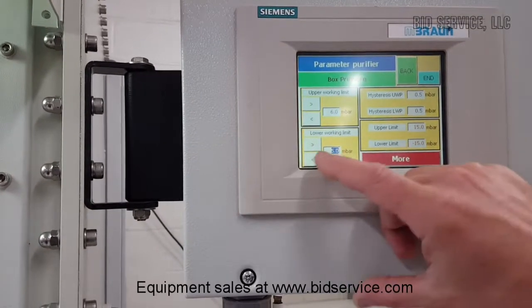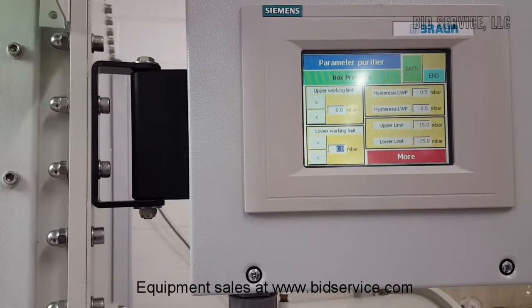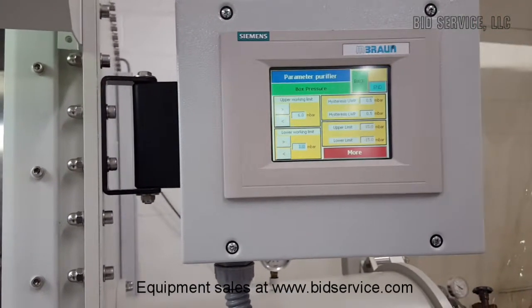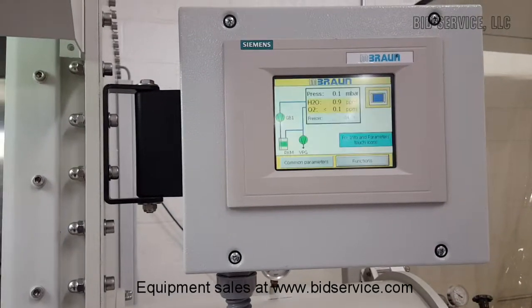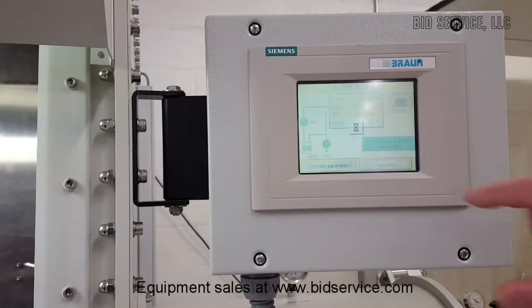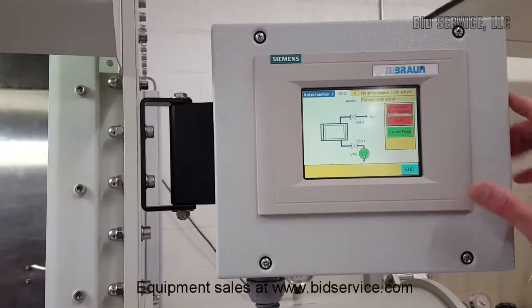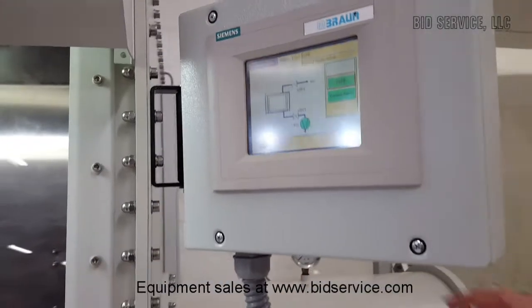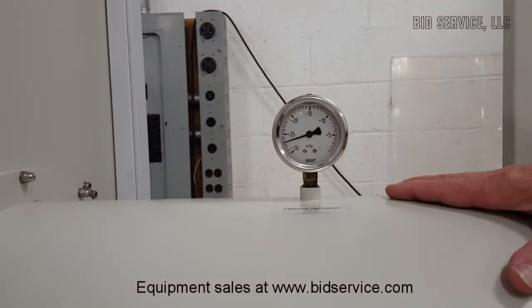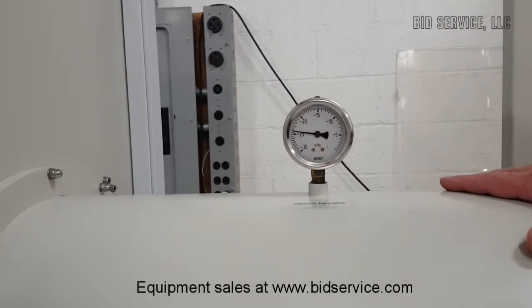That was set to 6. I'm going to set this to 1 and keep it on positive, because what I'm going to do is vent the large antechamber. So I hit end. This little box here on the side controls your large antechamber. I'll do a refill. If you look at the gauge here, you can see it was at vacuum — that's minus 30 inches. It's bringing the gas from inside the glove box into the antechamber to bring it up to atmospheric pressure.